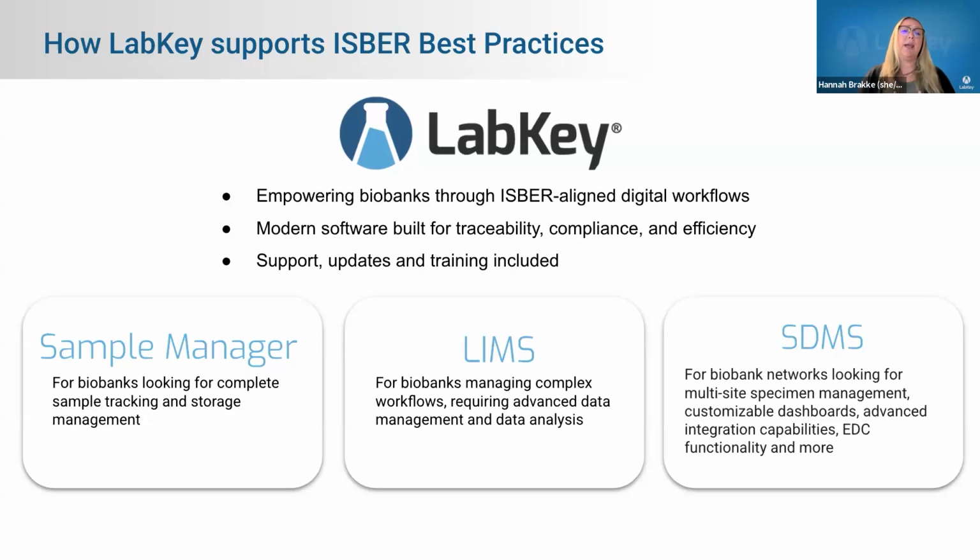And then finally, LabKey SDMS, which stands for Scientific Data Management System, supports the things that Sample Manager and LIMS have, but can also help support multi-site networks, which offers the ability to have custom dashboarding, advanced integration capabilities with things like REDCap or Tableau, Spotfire, as well as built-in EDC, or electronic data capture, functionality.